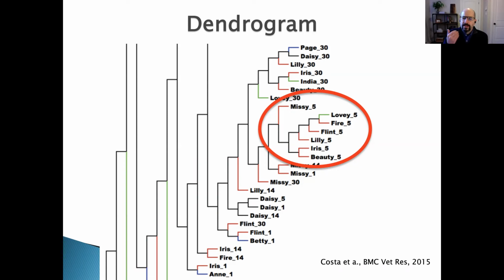The second question was, just looking at a PCoA or a dendrogram, can I tell if it's a membership or a structure? And the answer is no, you cannot. You have to read the legend of the figure, and there you're going to have it saying figure 2A membership, figure 2B structure, okay?